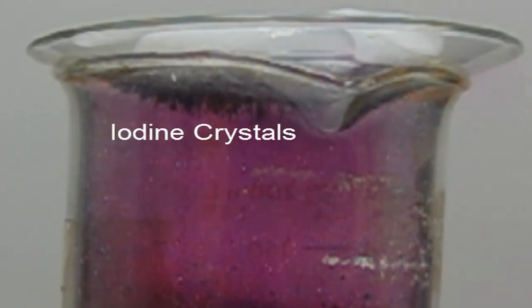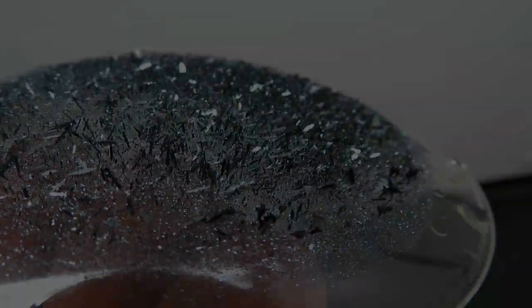If we were to take that watch glass off and look at the crystals, they'd look something like this.